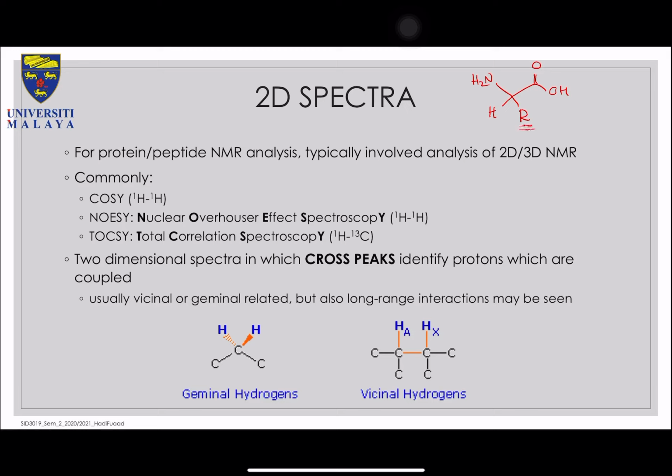You can have different R groups, for example, and just based on one amino acid, yes, you can clearly use one NMR to identify the amino acid. But imagine that you have this multiplied by, let's say, a normal peptide of 20 amino acids. Now your NMR spectrum will be more complex and there will be a lot of overlapping. Therefore, you normally use a 2D NMR or 3D NMR to actually identify the sequence individually. Okay, we will look at that next week.